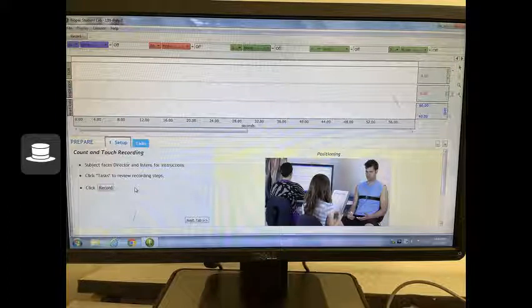Now is the time to decide the order of questions and tasks you will have the subject complete. Each subject will answer the same questions, but they must all be asked in a different order so the subject cannot prepare for the next task. Once the order is decided, make sure the subject is facing a blank wall with all of the group members and the questioner standing behind the subject. The subject should not be allowed to see the screen until the test is complete.